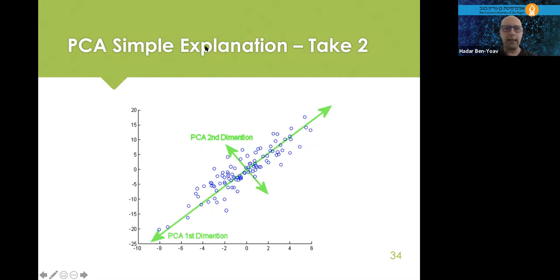So let's take an example that, for example, this is the signal that we measure, like the intensity or the absorbance at specific wavelengths. And this is the concentration of our analyte. Oh, no, it's not good. This is the log of the concentration. Okay, sorry.